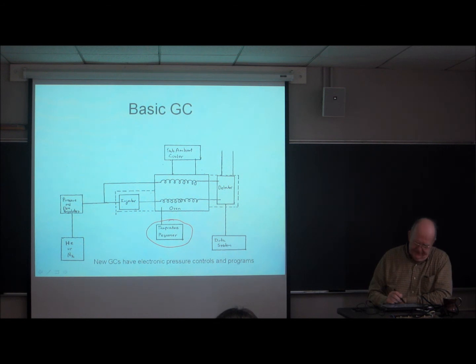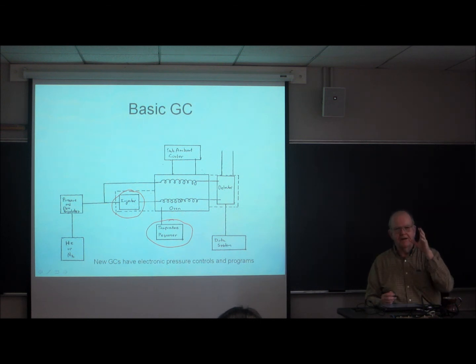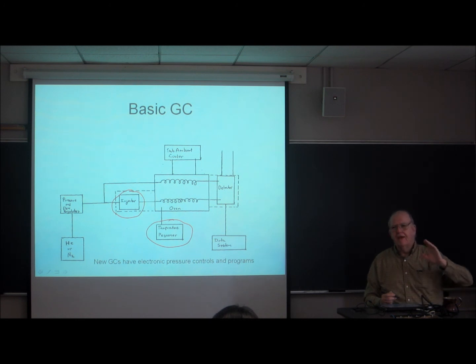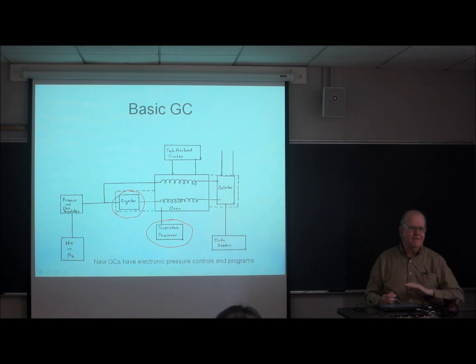You've got to get your sample into the chromatograph, into the column, and that requires an injector. The injector is absolutely one of the most difficult parts of a gas chromatograph to deal with. It's one of the most complex parts of the system. If you screw up the injection, you're done. You're cooked. It's not going to work.